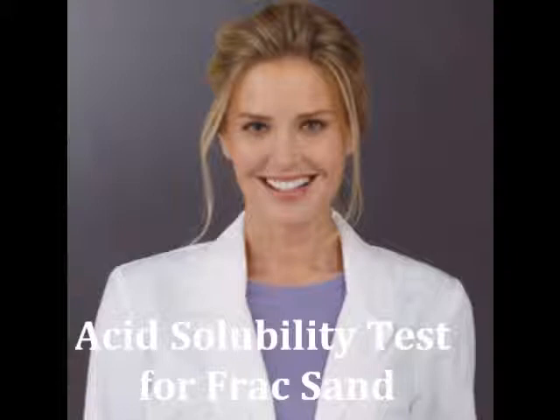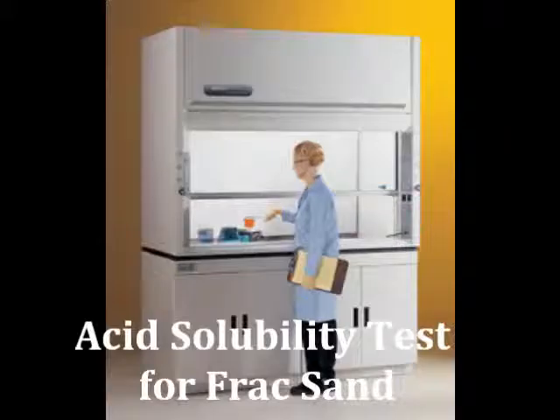Now, one of the most important things that has to happen is that the sand used for this test needs to be split down. The amount that you're using for the test is only about 5 grams. That's a small amount. So you need to get that 5 grams and have it be a representative sample. You need to make sure that the lab you're using is splitting so that the sample is representative of the larger one as a whole.